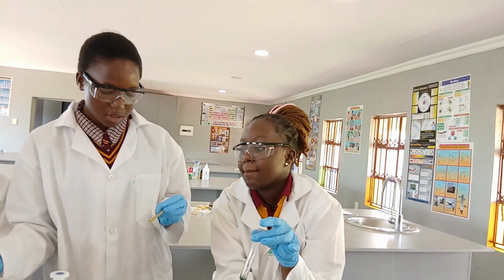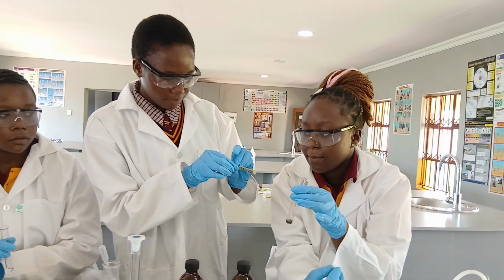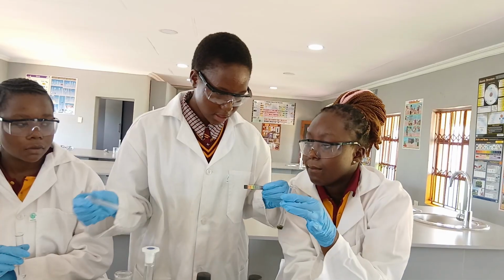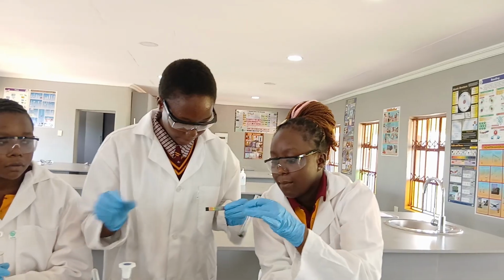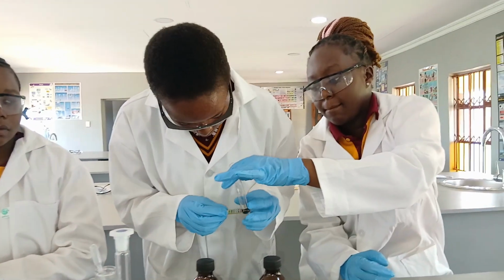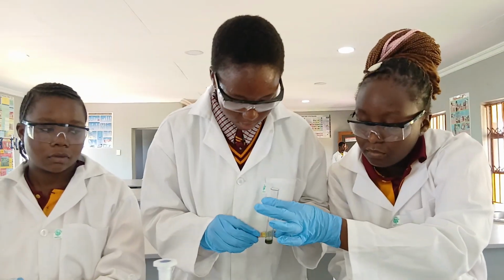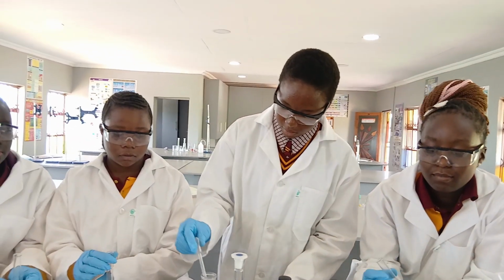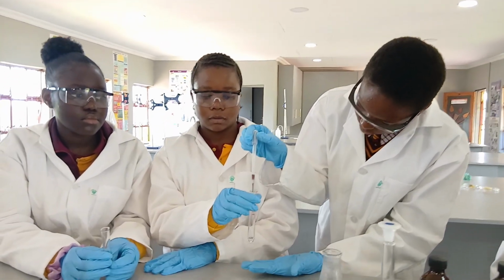And we're going to use our pH scale to check the color change and see if it's a weak base or a strong one. Using our pH scale, we can see that the color falls between 6 and 7, which means this is an acid. Then we're going to pour the second one into test tube 2.